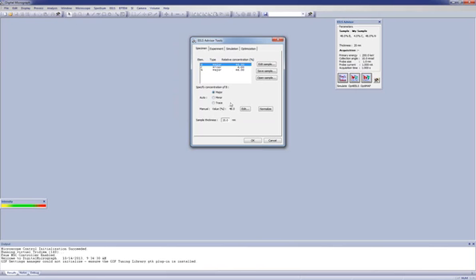These radio buttons are useful if you don't know what the true concentration of a particular element is in your specimen, so you might want to just have the software come up with some set of defaults for you. You can also manually edit the concentration by hitting the button adjacent to the value here. The sample thickness is 20 nanometers. That, again, is an input parameter used in the calculation.